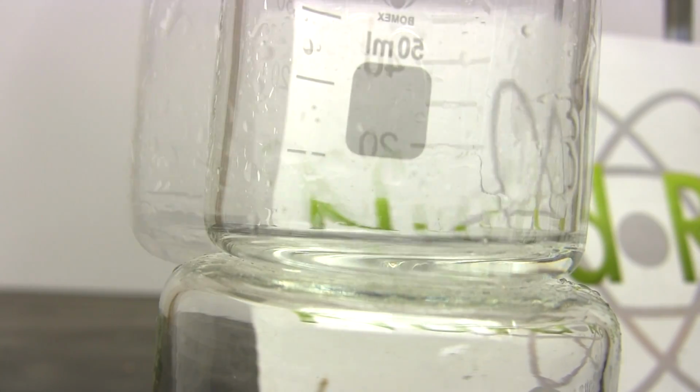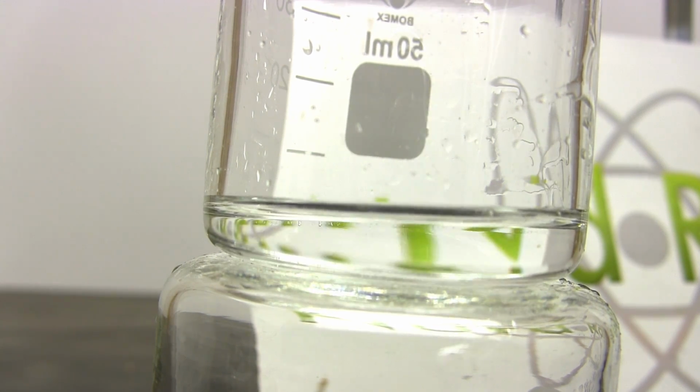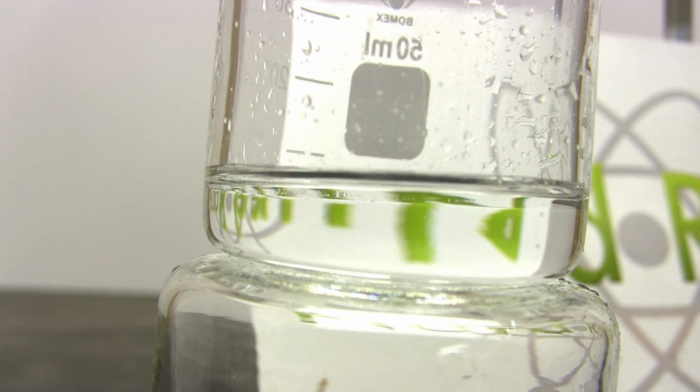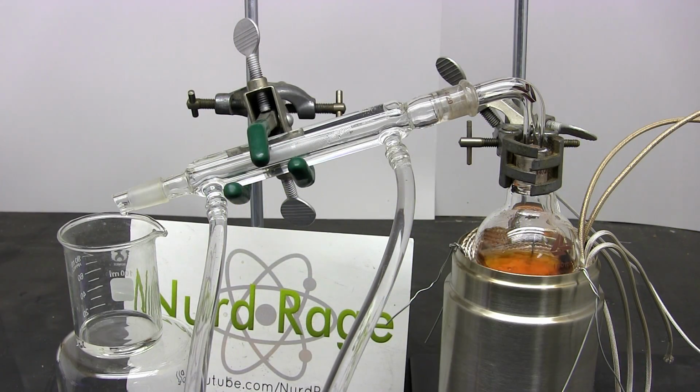When we've reached 98% pure azeotropic sulfuric acid, then the distillate will be clear and homogeneous without any distortions. This is because the density is now uniform. The acid from here on will be the highest purity you can get by distillation. Just keep going, collecting the clean acid until you have about 20% residue remaining of the dirty acid.